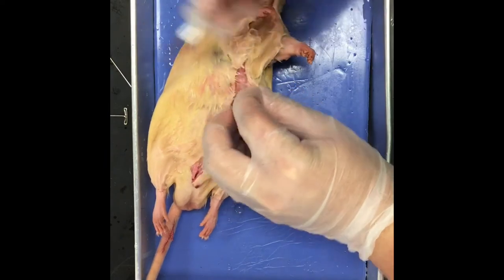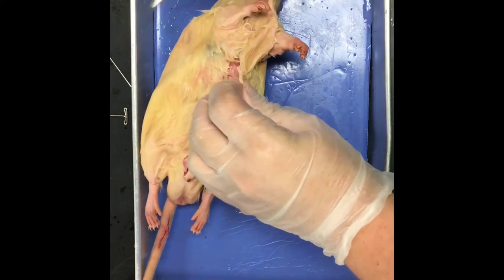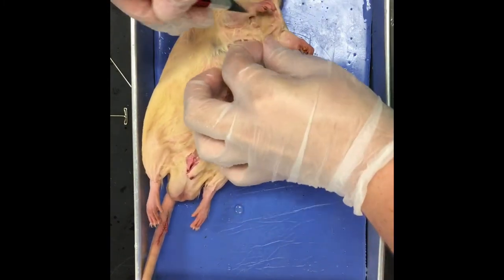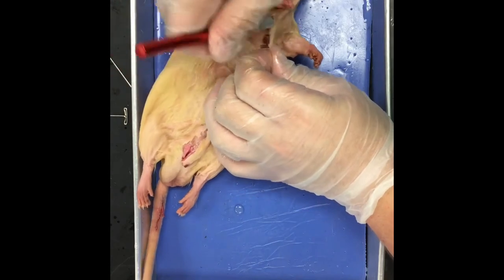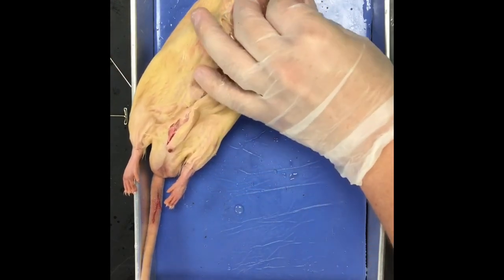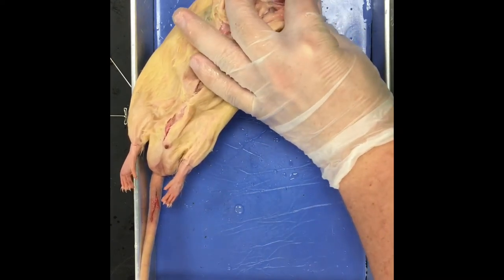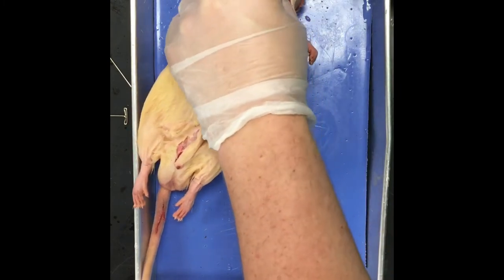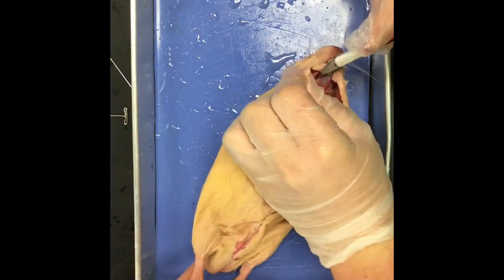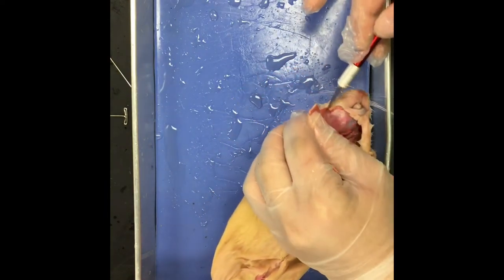So this is the skin and fur right here. These are the muscles underneath. So I'm exposing the muscles first. If you want to grab one of those trash cans and keep it near you, you're welcome to. All right, so you're gonna go through and you're gonna actually remove what skin you can.